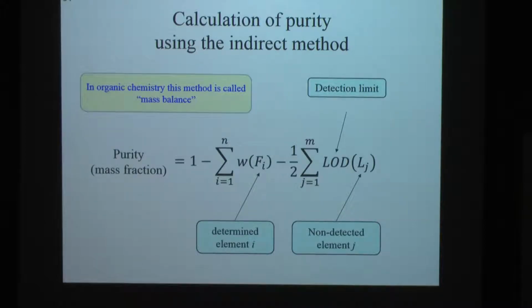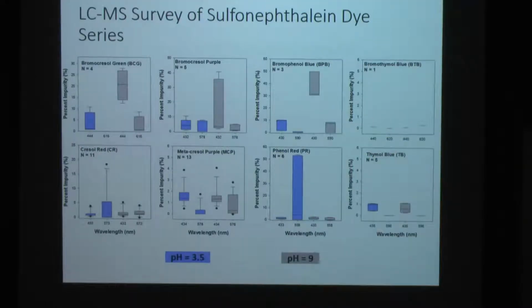How do we determine the purity of the metals that are used in preparing these spectrometric solutions? In organic chemistry, we use a method called mass balance. You take everything in the material as 100%. From that 100%, you subtract the sum of all of the mass fractions that were detected. You do a whole survey of the periodic table, and if you detect impurities, then you may use more accurate techniques to determine the high-level impurities.